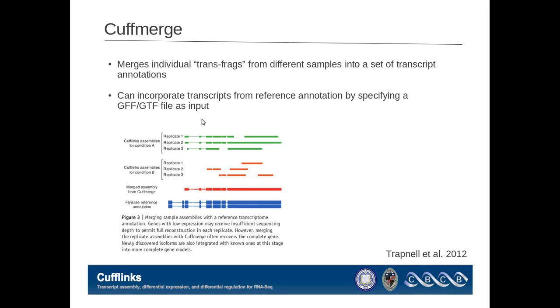Once again, as with all of these options I've mentioned so far, TopHat and Cufflinks and Cuffmerge all can use the GFF or GTF annotation as input, which assists Cuffmerge in identifying transcripts.